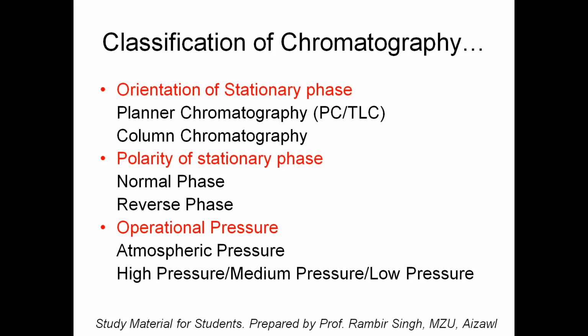Now, the problem came that when we are using silica as a stationary phase, we cannot use water as a mobile phase. Why can we not use water as a mobile phase? Because water is highly polar, so water will have the highest interaction with the stationary phase.